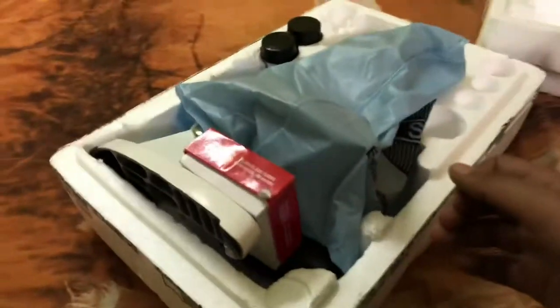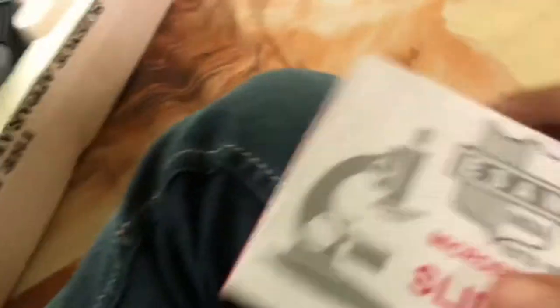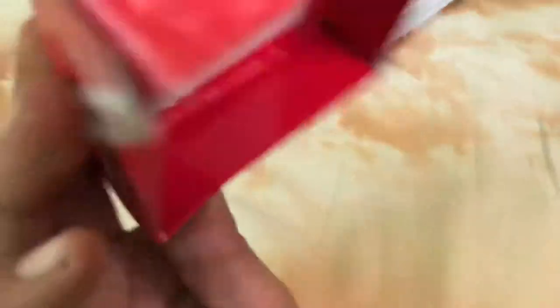Seriously, they've got to stop sending manuals. Can't wait. What's this? Slides. Yes, slides. Supposed to be 50 slides. Yes, 50 slides.